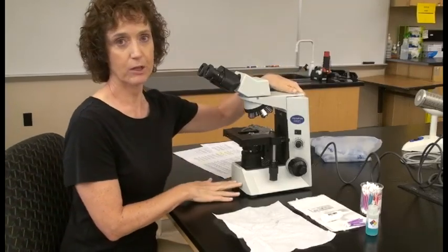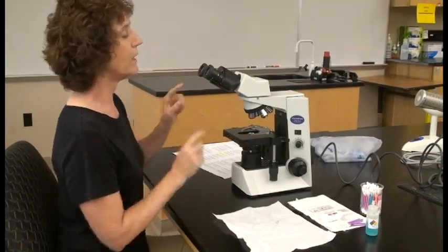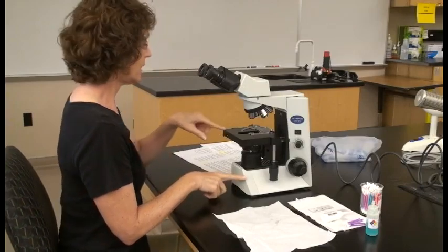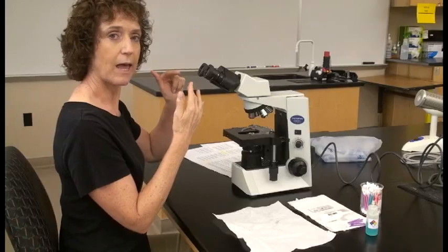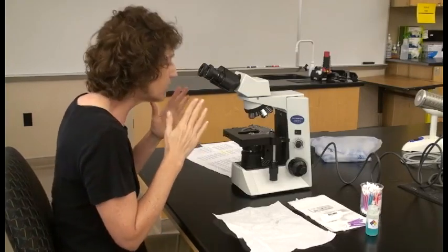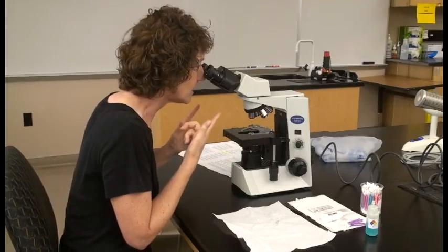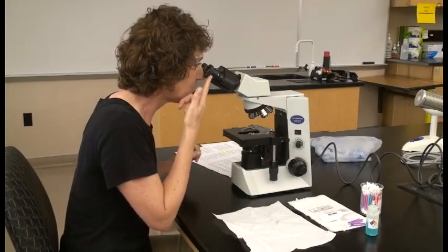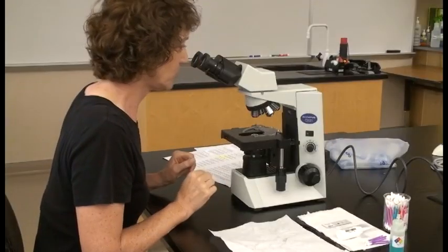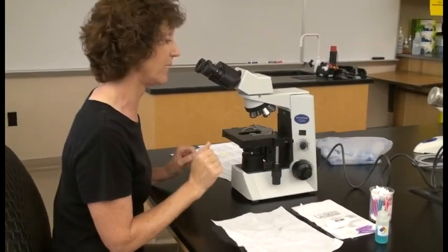After the microscope is set up and the electrical cord is in place, take a quick glance and make sure everything is clean to start with. Also make sure your lab chair is adjusted so you can look into the oculars without hunching over. You want about this much space between your eyes and the oculars so you see one field of view and don't see your eyelashes.